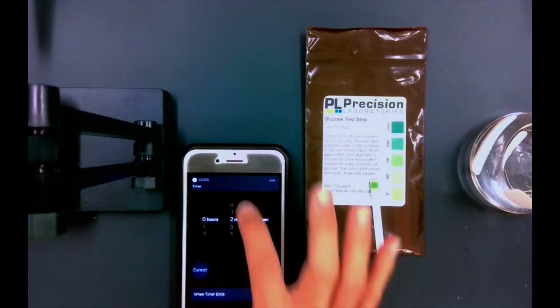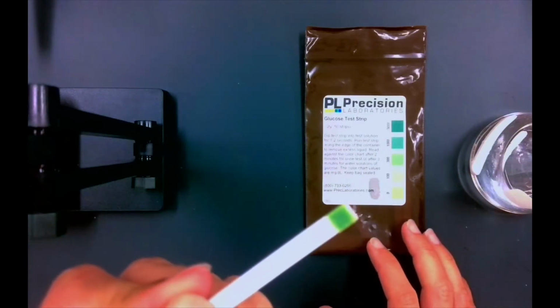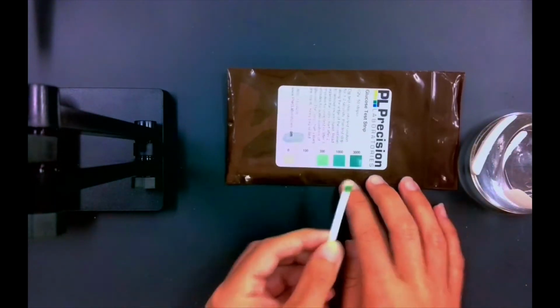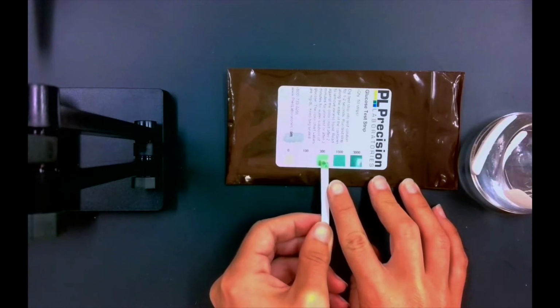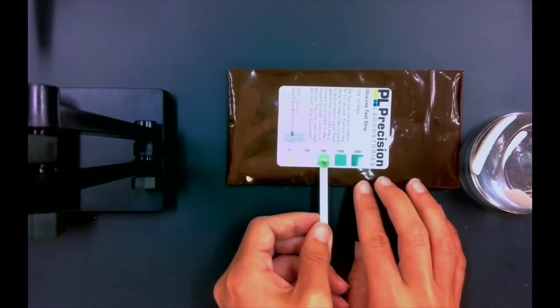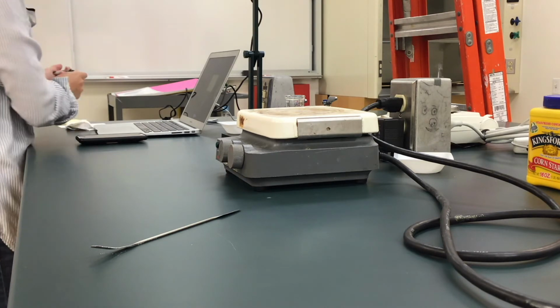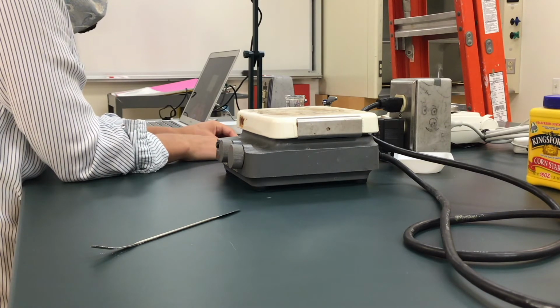Okay, so our timer is done. I turned down the brightness on the video a little bit so that you can see just how much our test strip has changed. And I'm going to use this scale on here to determine what my concentration is. That looks a little too light, still a little too light. So I'm going to say we're right around 300 milligrams per deciliter. And I'm going to make sure that I record that, 300 milligrams per deciliter. So that's the concentration of glucose that will be in our solution.